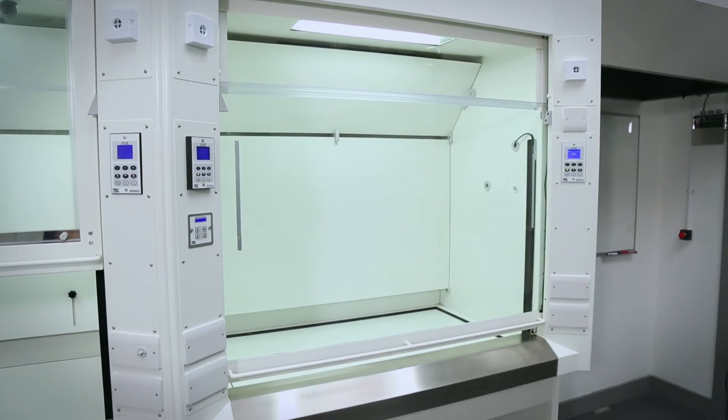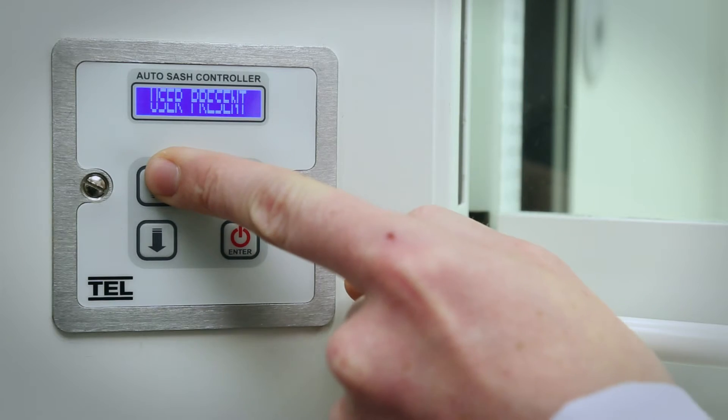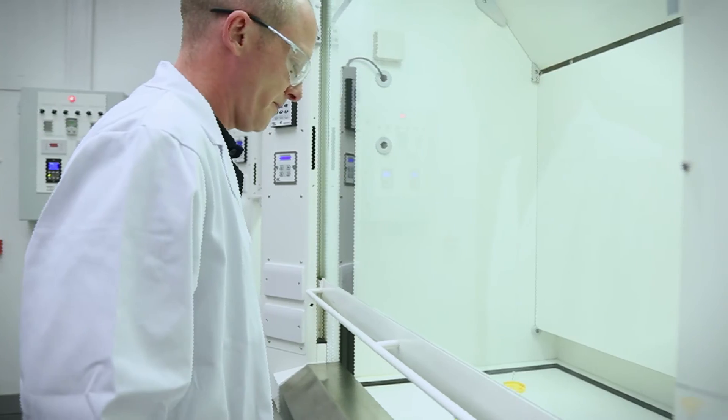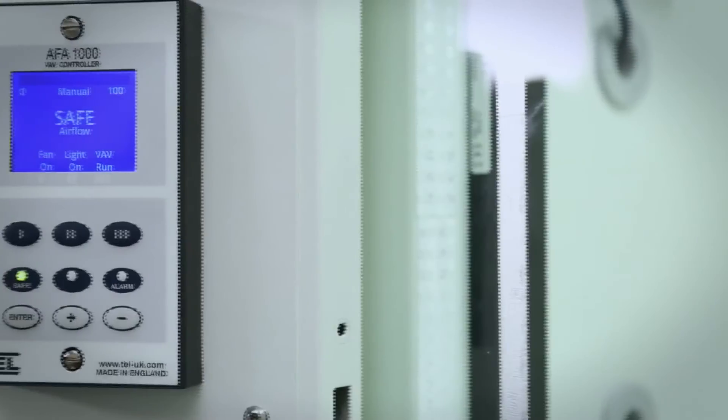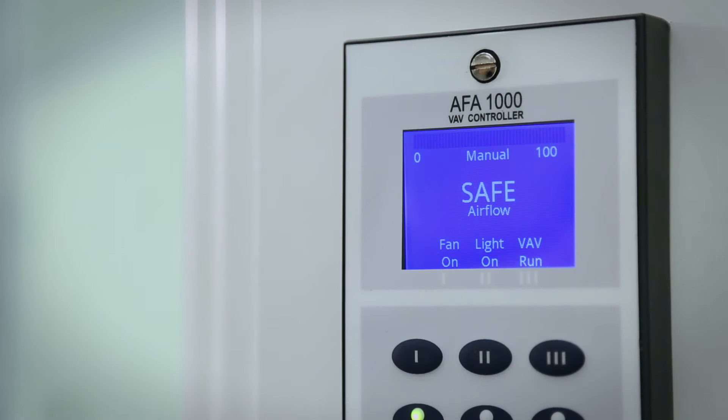TEL's innovative auto sash controller for fume cupboards immediately increases the safety of your fume cupboard to its operators. It will also maximize energy savings when used with a VAV airflow controller.